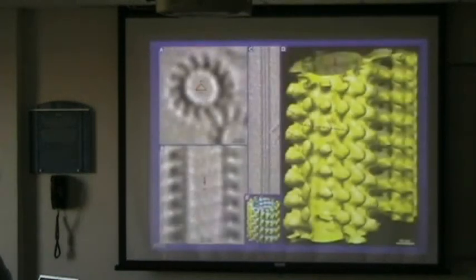We can actually average this together once we know much better what it is, because now we have a 3D, so we actually have this a bit better under control. And then we can make an average structure like this. And in this case, unlike with a helical reconstruction, we can see things which we otherwise would not see, like for instance these bridges and stuff, or the seam. You see, this is this lattice seam.